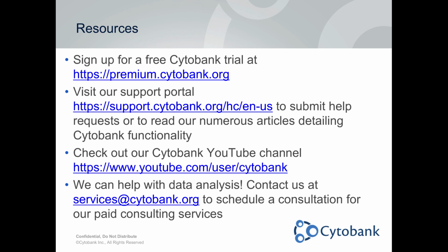Yeah, we didn't select based on the type of the sample, because it may introduce a bias to your data. So basically, we run patients and actually we've got other projects that we are doing. We run patients and healthy donors at the same time, and we select them based on how many samples we can run on one day.